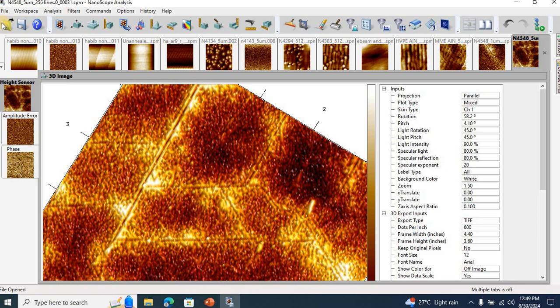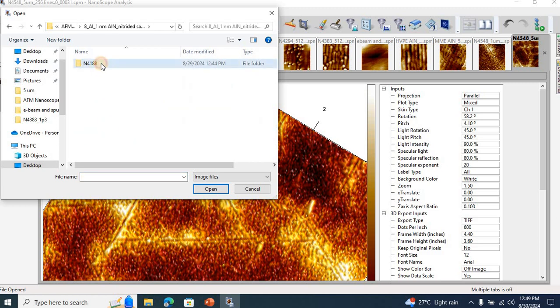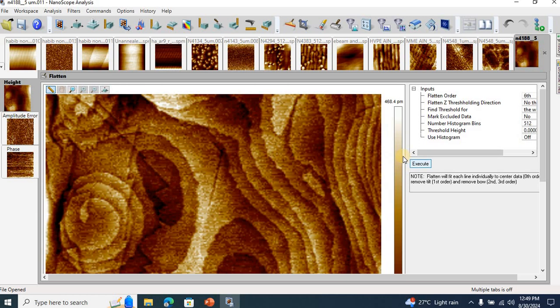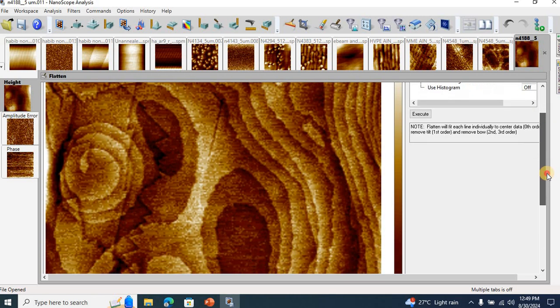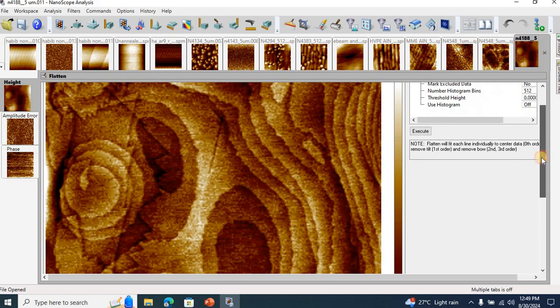Similarly, let me show you another result, and it's an aluminum nitride film grown on top of nitrided sapphire substrate with a 1 nanometer intermediate aluminum nitride film, and you can see it has high quality as well. In fact, you might find that we are growing the best aluminum nitride films on top of sapphire substrates in the world. So we have special recipes for that purpose.